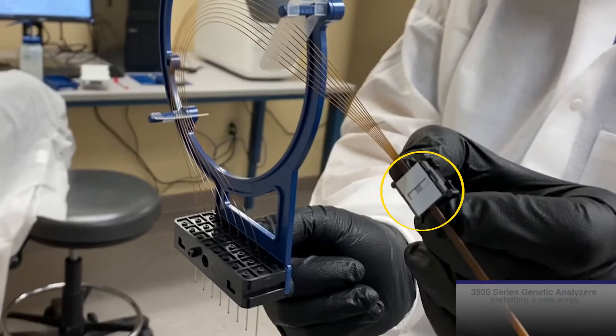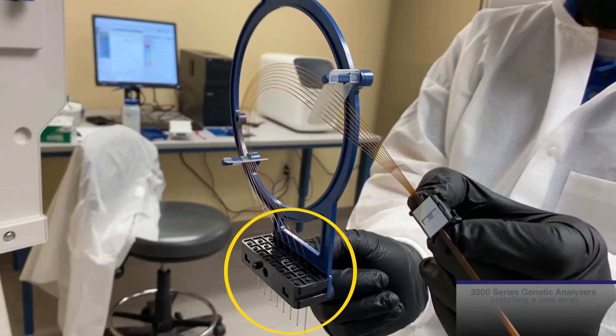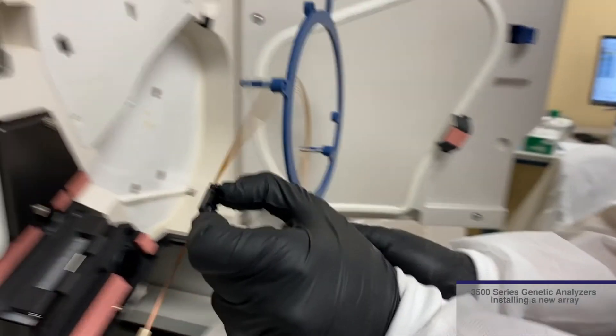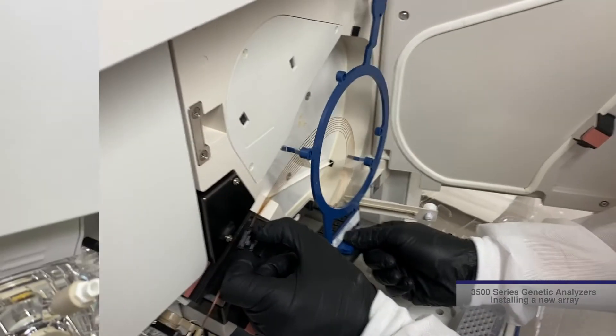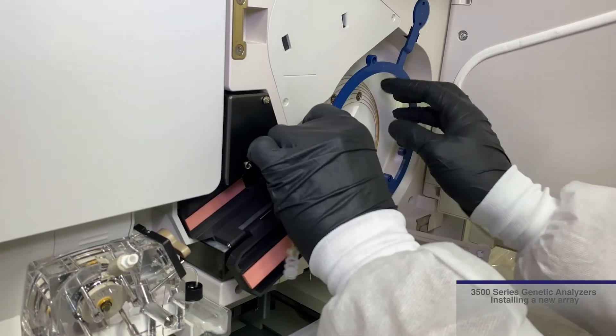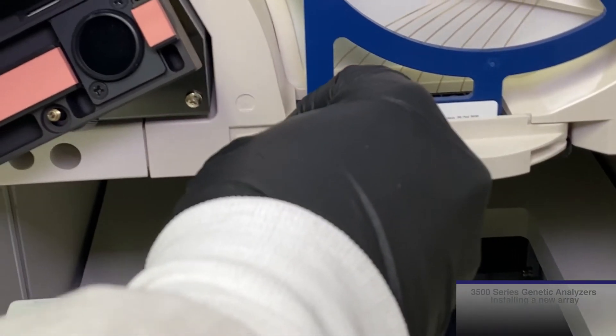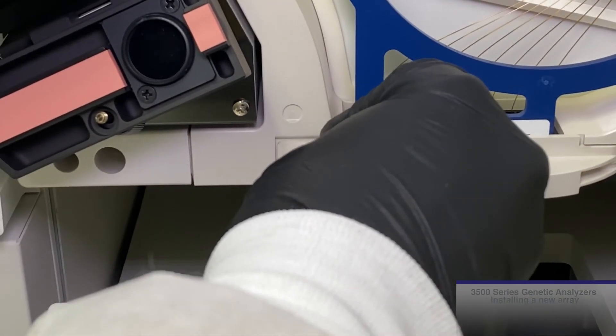While holding the detection cell window with your left hand, hold the front of the array header with your right hand and slide it into the housing. Push it firmly against the back. Swing the array header latch closed and push in the snap pin connector to lock it in place.